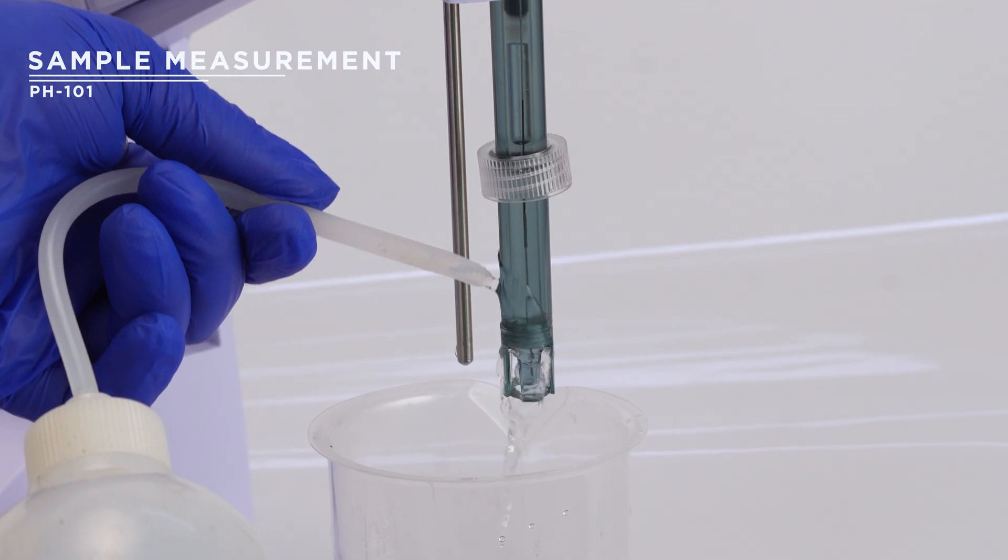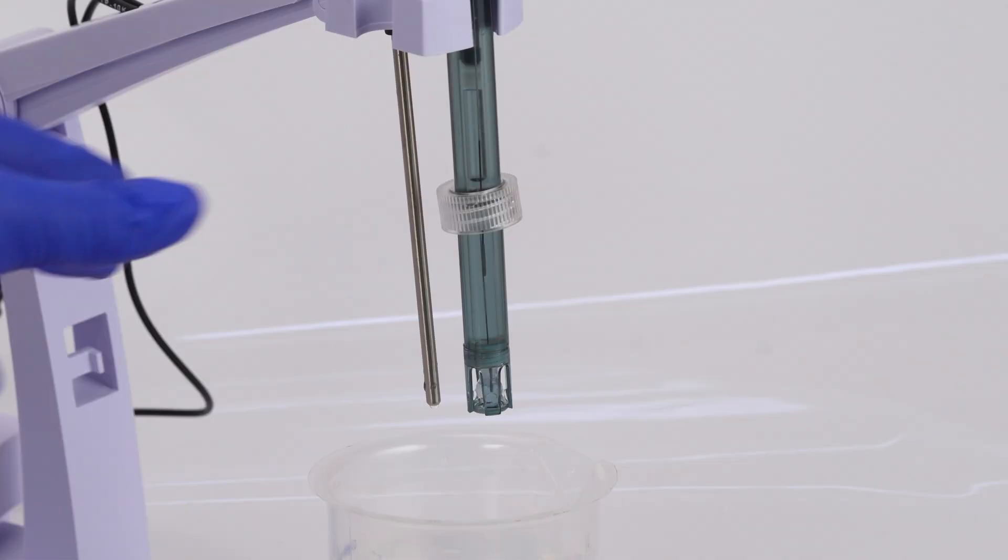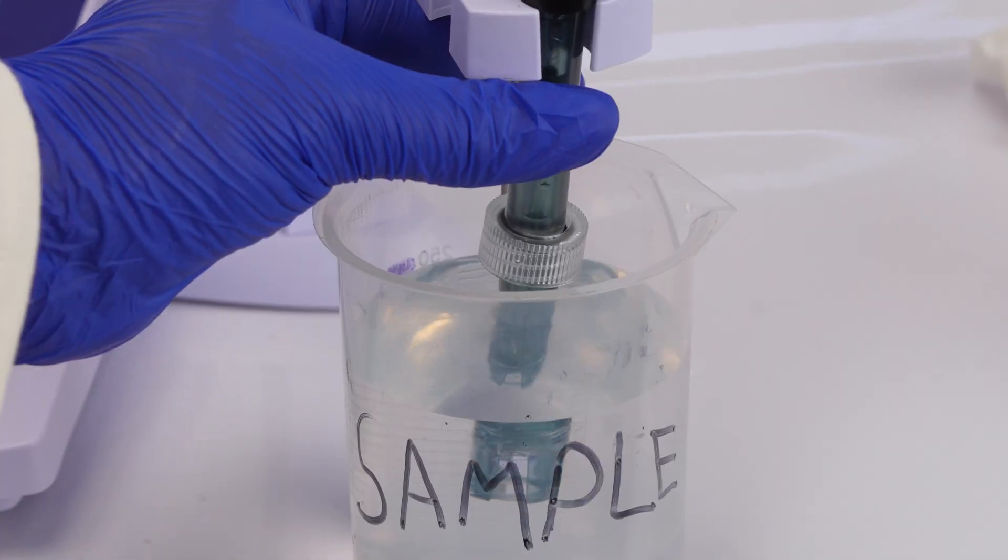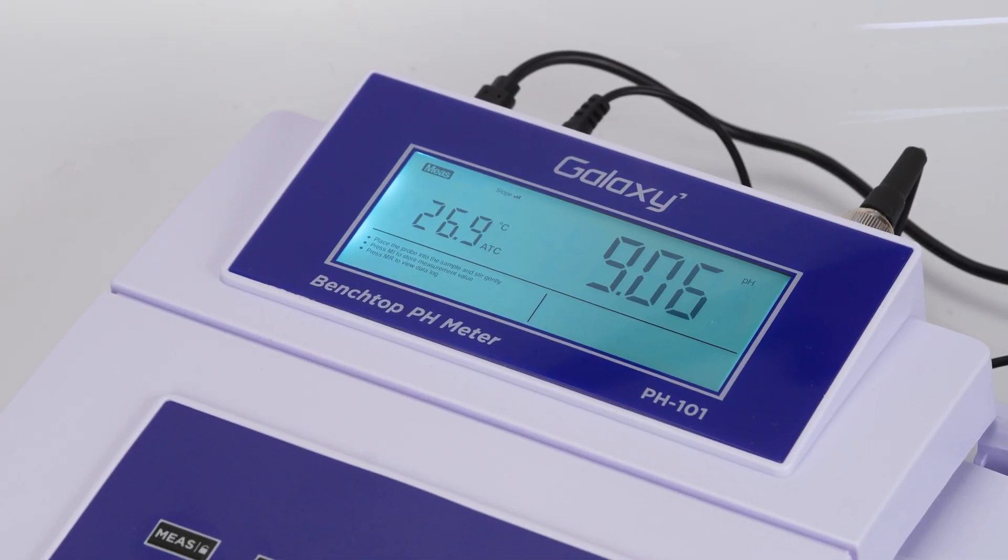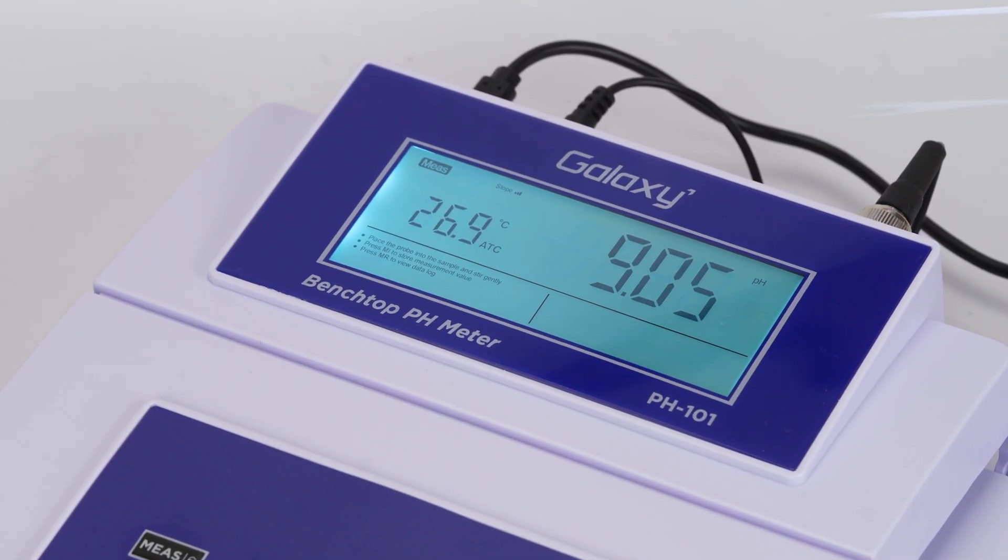Rinse the electrode with distilled water and place it into the sample. If auto hold is enabled, the meter locks the measurement when stable.